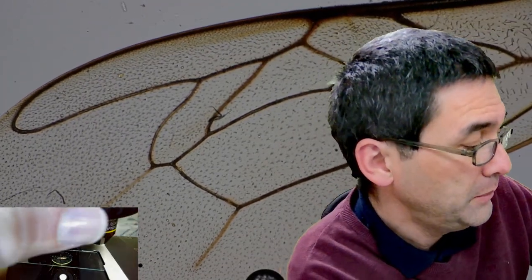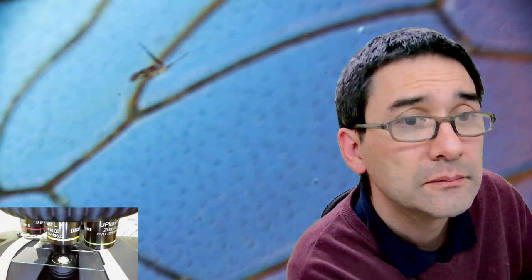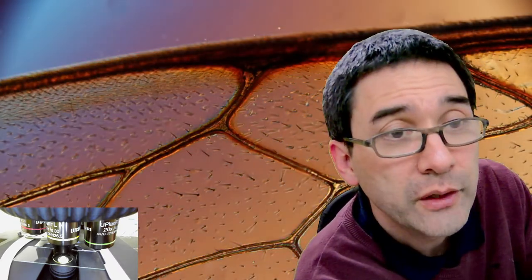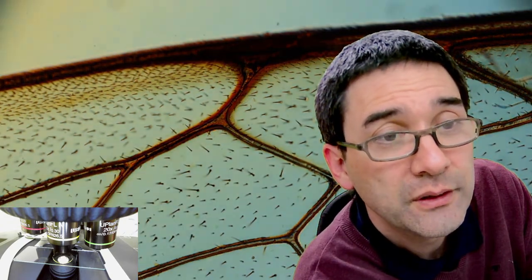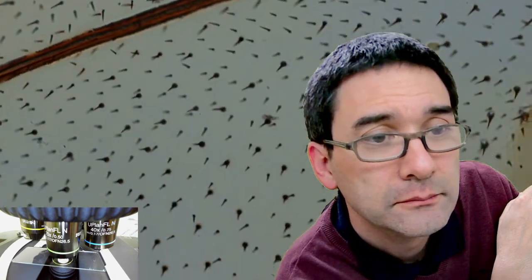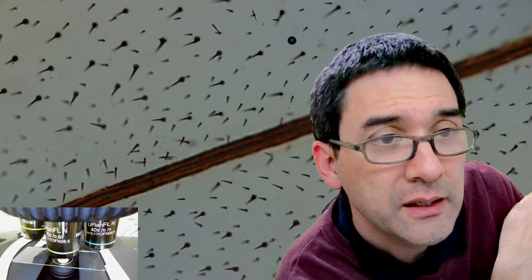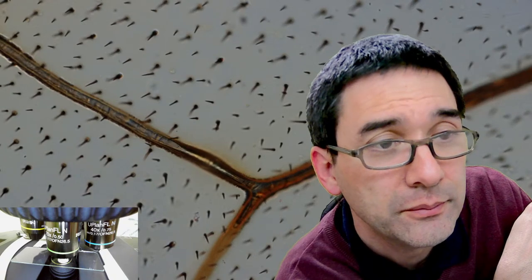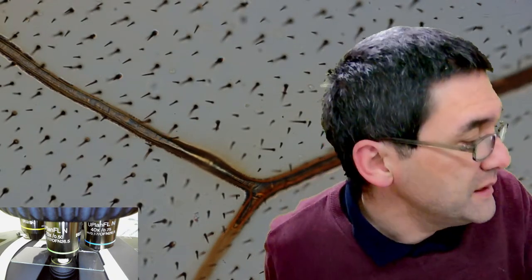But let's see if maybe it's also kind of worth investigating. Let's see if the bubbles will actually stay. And let's go up again with the magnification. Of course, we have to refocus a little bit. And then you see the tiny little hair of the wing. And of course, if I shift around to play around with the prism, then I'm able to get different colors as well. Maybe 20 times should be okay. Let's remember a little bit how it looks, and then let's check again next week to see if indeed it started to clear up a little bit. Okay. So that is now the wing of a bee.